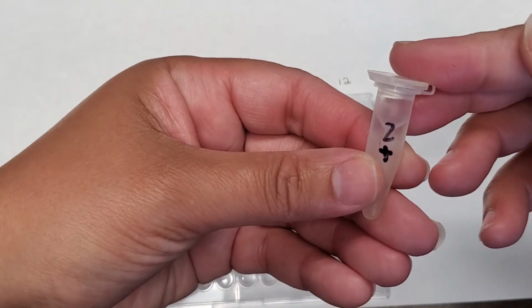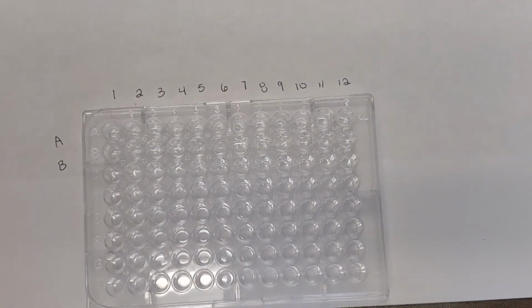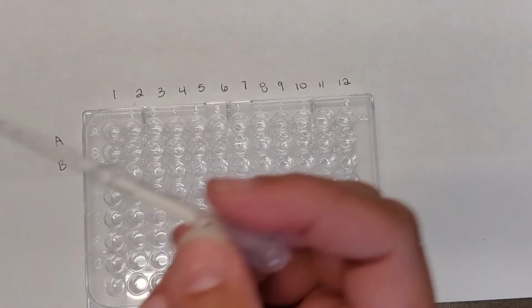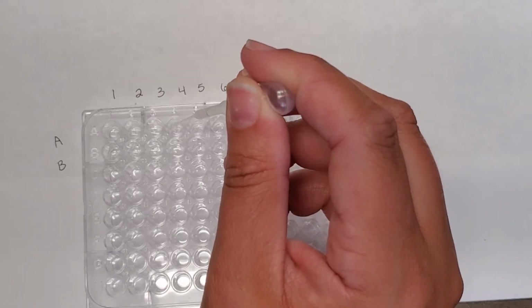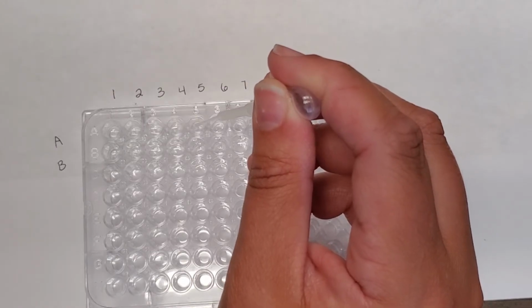Our second one is our positive control. So this serum actually would be like blood plasma of the patient that contains the antibody. So we want to see what a positive reaction looks like. So again, we're going to add that now, this time 3 drops into wells A4, 5, and 6.